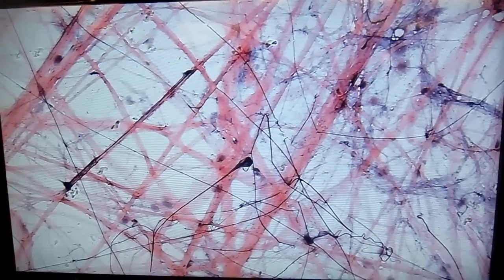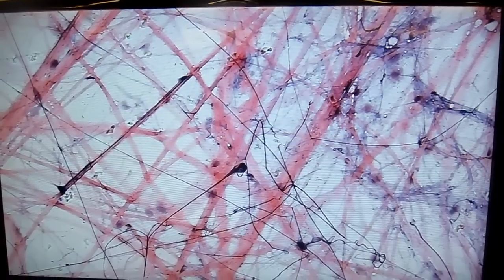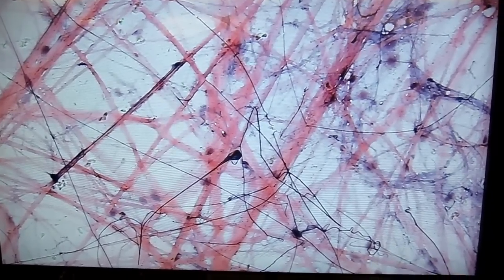And the collagen fibers are what give a connective tissue its strength. The purple fibers that you see that are much thinner, and in some cases, irregularly shaped, are the elastic fibers. And elastic fibers do just what they sound like they do. They're stretchy.